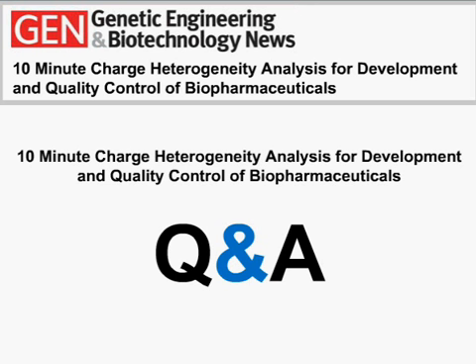And there was no sample pretreatment. In this case, we just diluted the sample right into the ampholyte mixture and tested it. So I hope that answered the question.